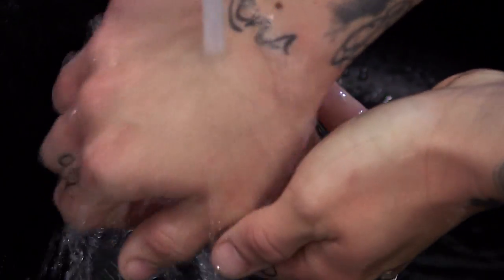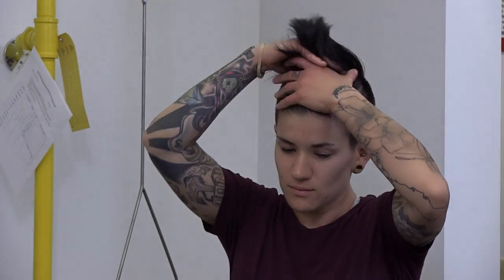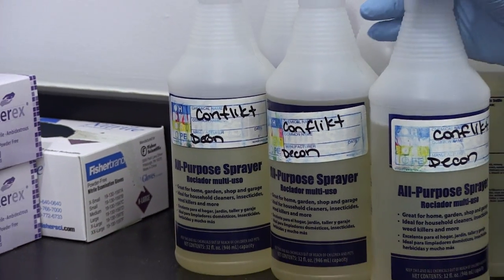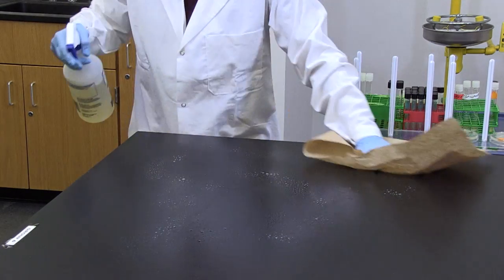Wash your hands prior to beginning the lab and just before leaving as well. Tie back any long hair. It is both a source of contamination and a fire hazard. Disinfect your bench top with a disinfectant prior to beginning work and just before leaving the laboratory.